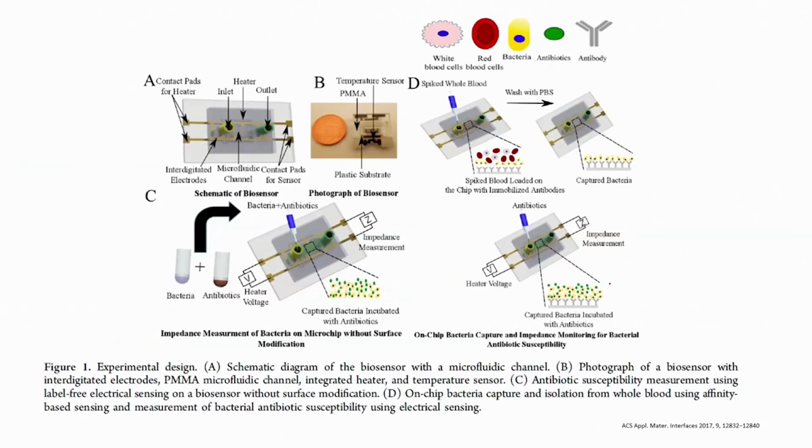Now, how can we perform the experiment? How can we come up with a technology that is faster, that is rapid, and that is not costly as well, all right. So, if you see this particular device, then we will see how we can fabricate this device.